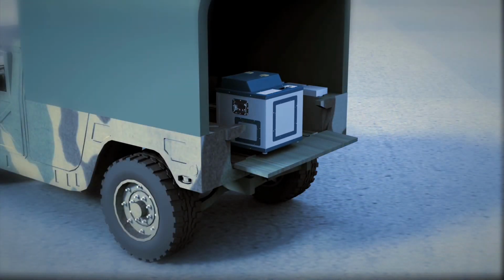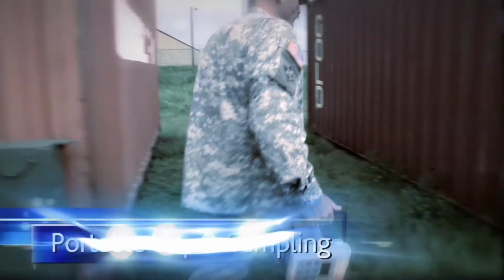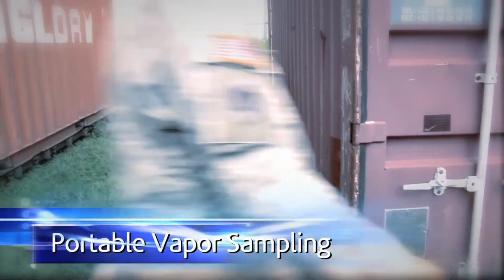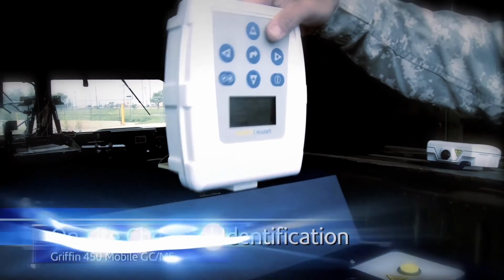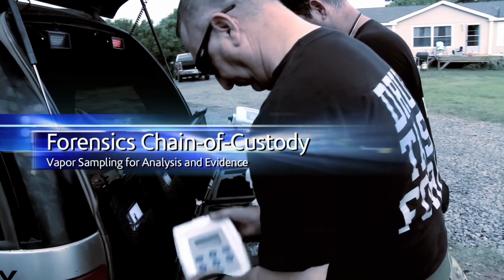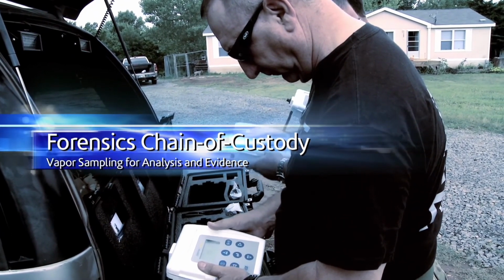It is quite actively in use by the military, and you can see they've got this cool animation here, but they actually do have these deployed. They've deployed these to Iraq and Afghanistan, and they sell them as simple units. You can see that's basically a headspace unit. They can capture vapors and then come over and put it on the top of the GC column and heat it so the vapors come off. Here is a drug unit that is doing vapor testing at the crime scene.